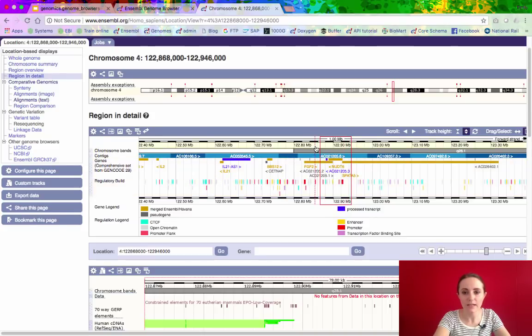In this view, you can again see the chromosome band. You can see the contigs, which is shown by these alternating shades of blue. And the genes are shown underneath as these coloured blocks. The labels are shown underneath the genes. So you see this gold block here. If I follow the leftmost point of the gold block down, I find this label FGF2, and I know that that label belongs to that gene. This big gene here, if I follow the leftmost point down, it's SPATA5.